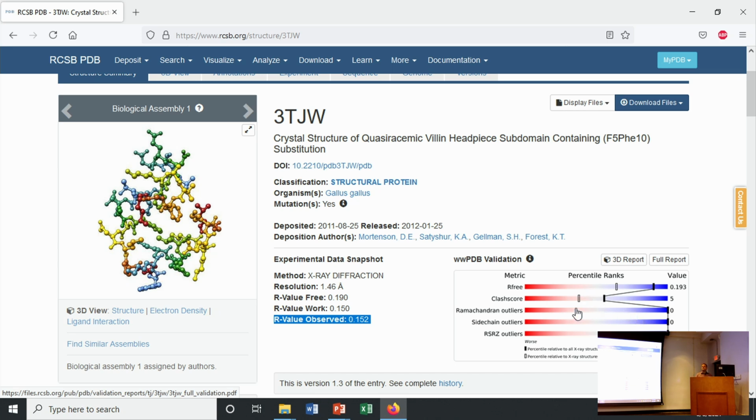But it does give you a feeling for, okay, there might be 1 or 2 clashes in here that might be representative of real problems in the experimental data. But again, keep in mind that these are experimental conditions. Maybe there's something energetically going on that's actually causing there to be a steric clash, right? In steric clash, remember, you're just assuming that atoms are hard spheres and they're bumping into each other. But remember, in reality, atoms are actually surrounded by electron clouds which have some deformability.